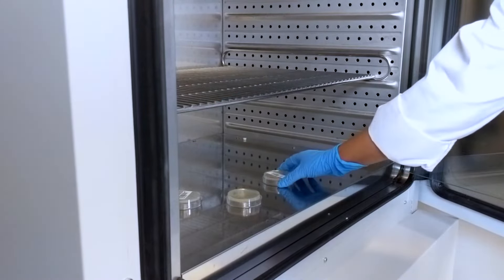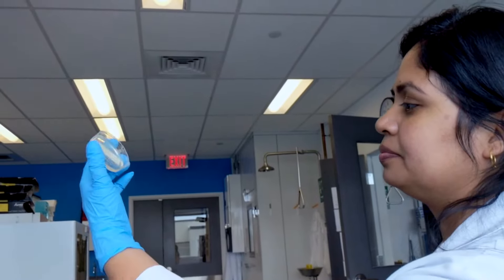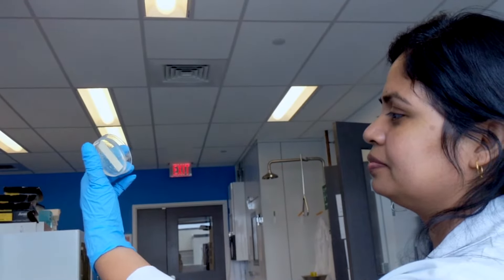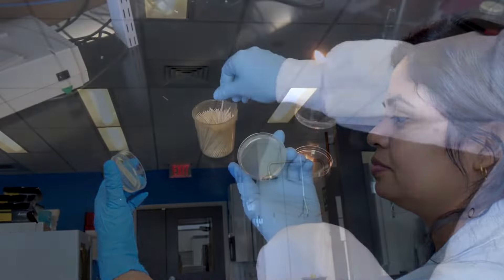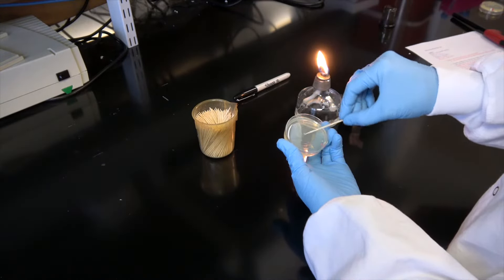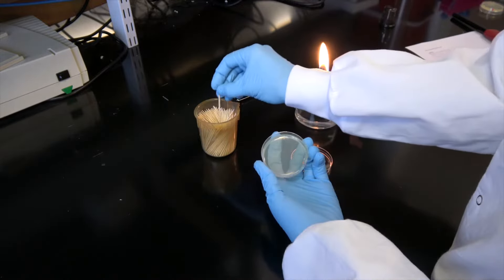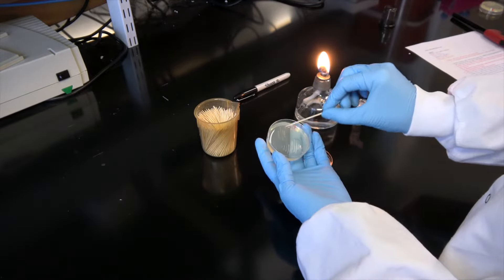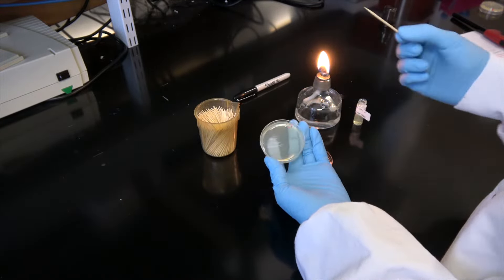After overnight incubation, inspect your plates for visible colony growth. Remember, your control plate should have no visible colonies present. If your sample plate has colonies that are too close together, you can pick a clump of cells and streak for single colonies on a new plate. See our streaking for single colonies video for more information.